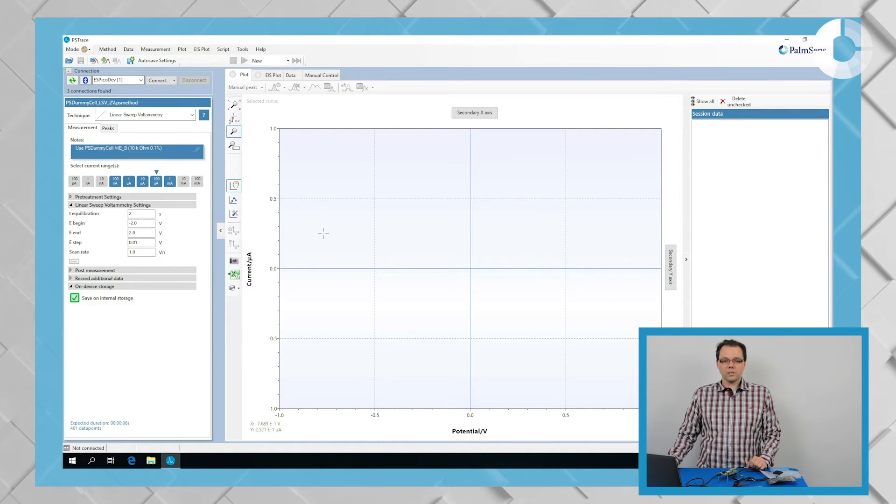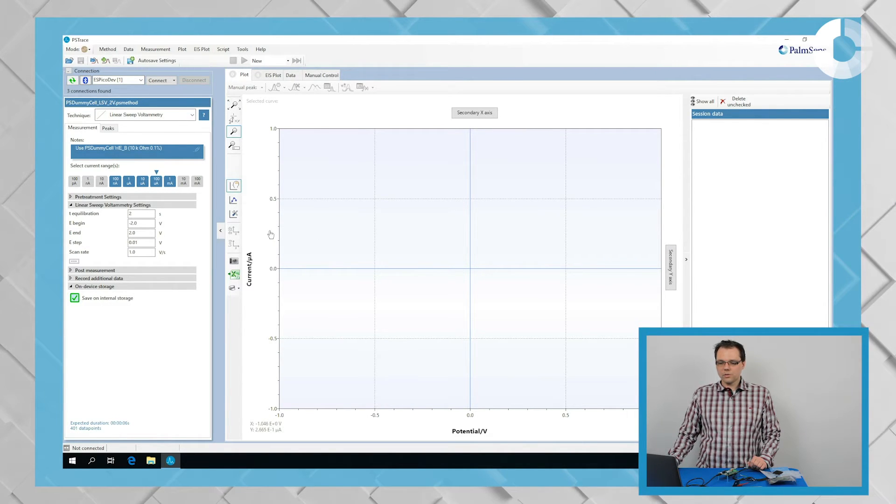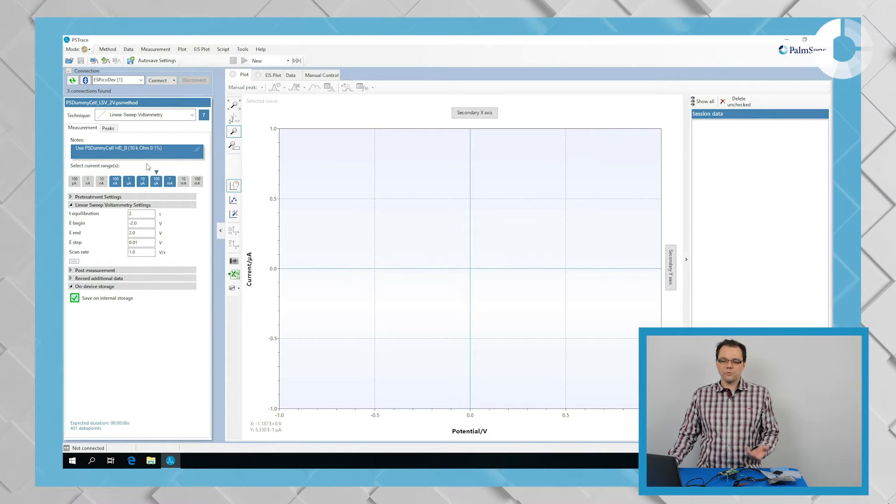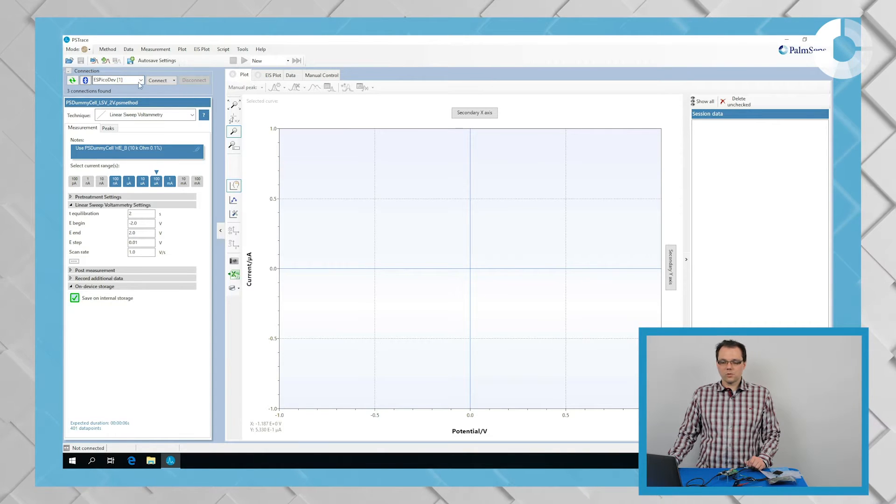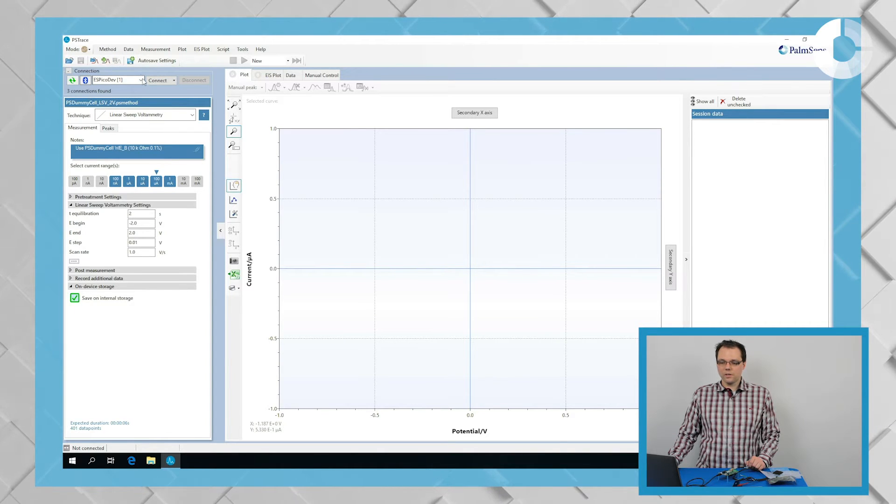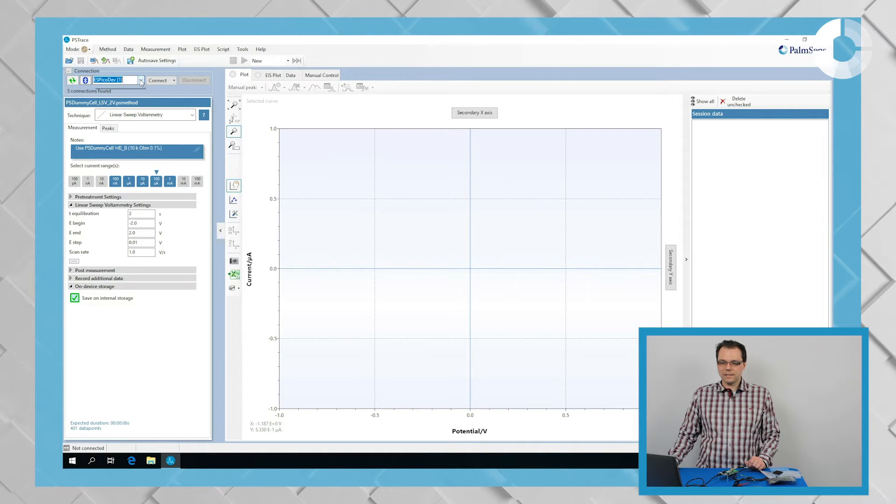To start your measurement, you will have to first connect the development board to the software. For that, you need to make sure that in the drop down menu in the top left, the Amstead Pico development board is selected.